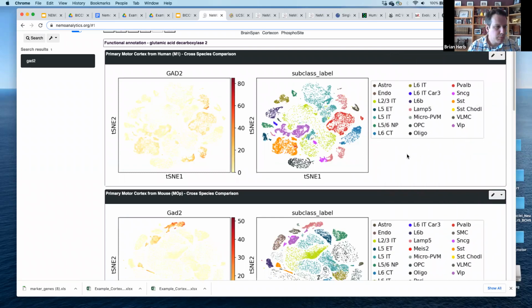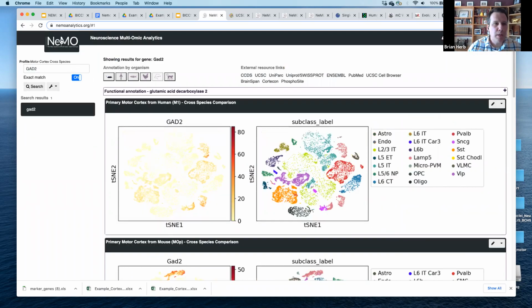All right, pause for a moment. Any questions on just general profile and how that works? Okay. If you would please, let's return to the front page.